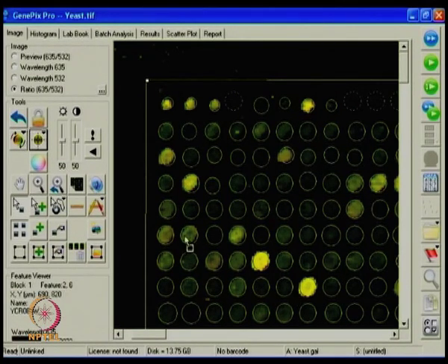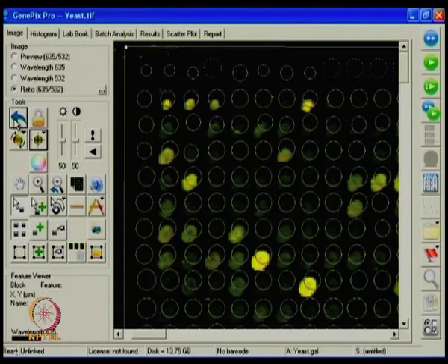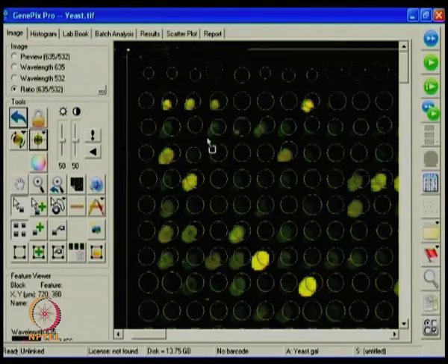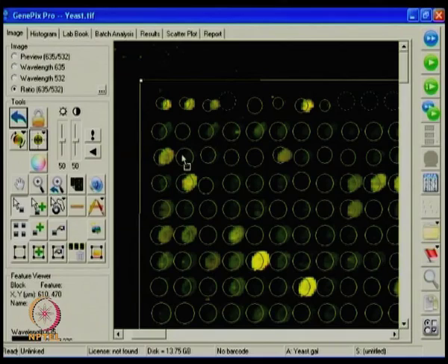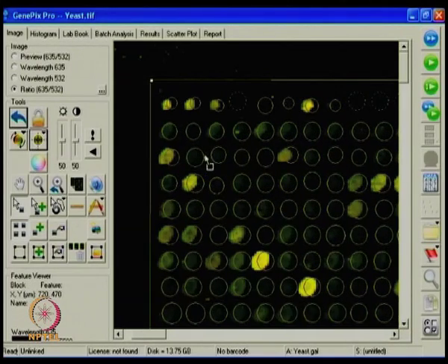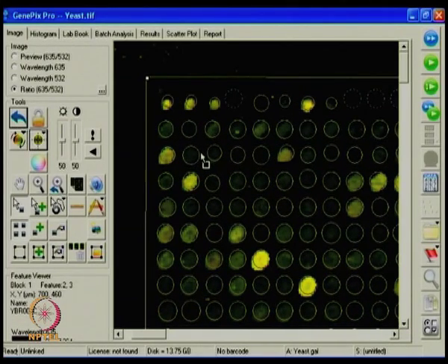One thing which is good here is that it automatically adjusts according to the spot size. The overall width is adjusted accordingly, since some spots are not so uniform, so it makes that correction here. As you see, you can actually move it, but it doesn't affect anything as long as you have done it once and the data is being stored. People usually ask me, is it a good idea to do it once again if I happen to move it? It's not a bad idea because it takes a few seconds.